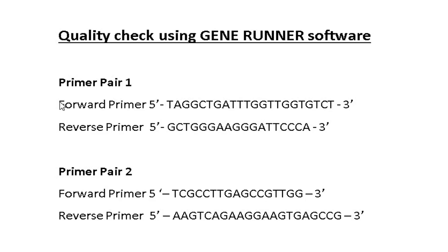Here is a list of two primer pairs. Let us check the qualities of these primers using GeneRunner software.